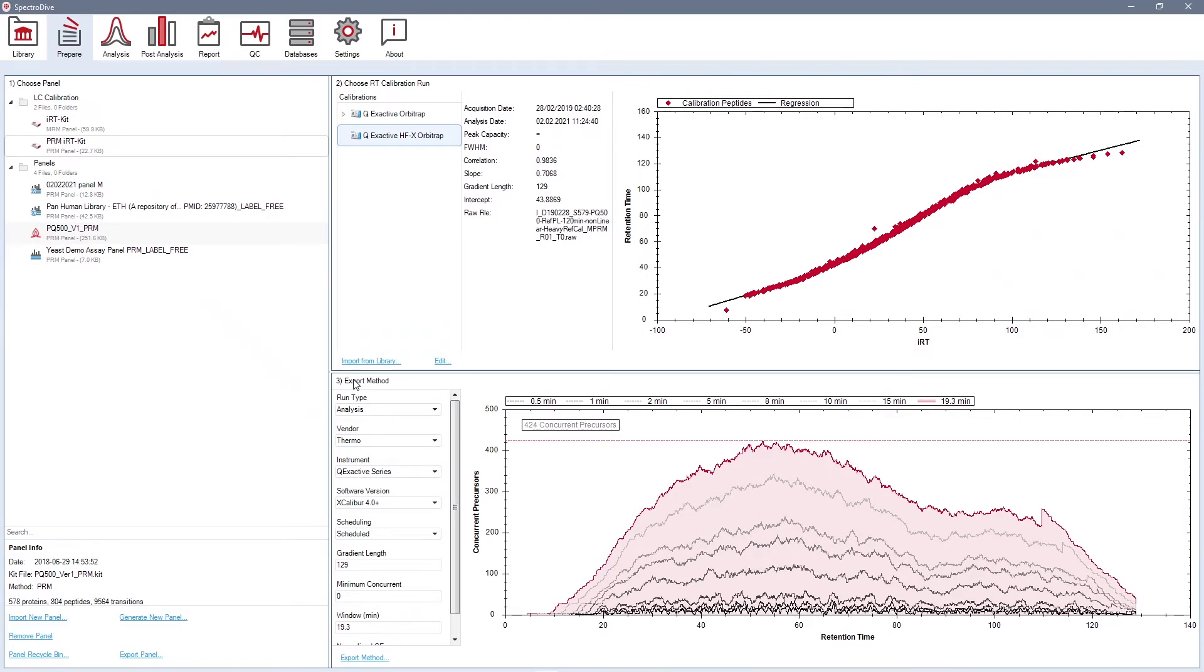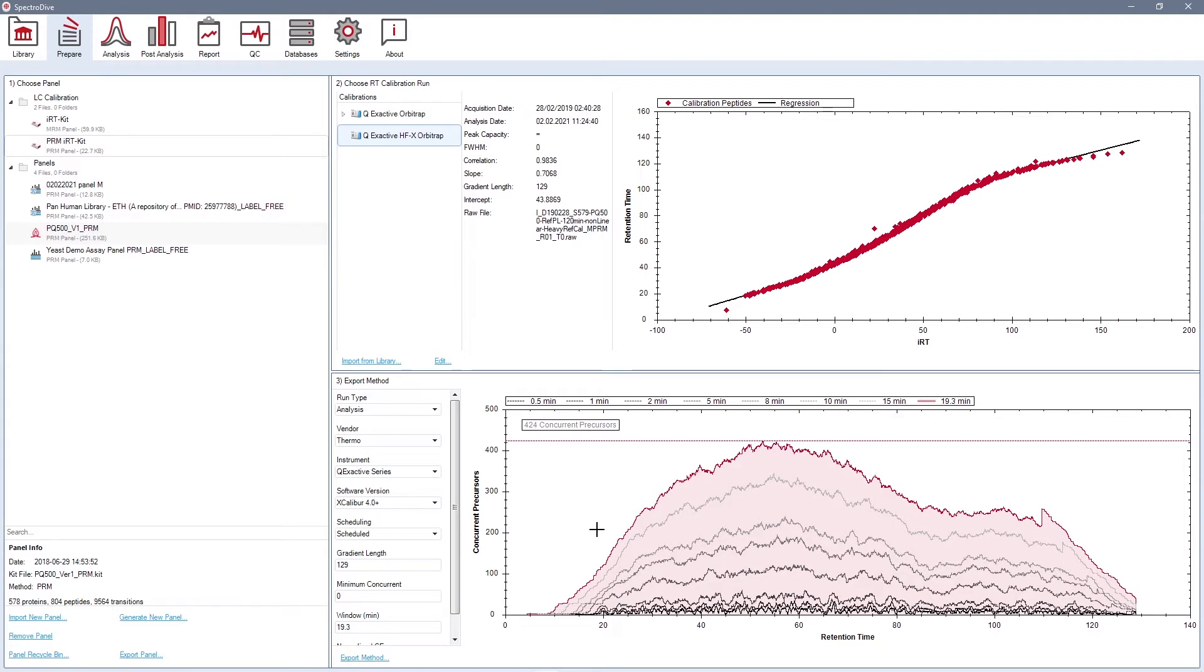Finally, in the export method window, you can specify scheduling and instrument-specific settings. On the right side, you can see the concurrent transitions plot. This plot gives you an overview of the scheduling of your panel, also showing the highest number of concurrent transitions for MRM or precursors for PRM, given your other settings.